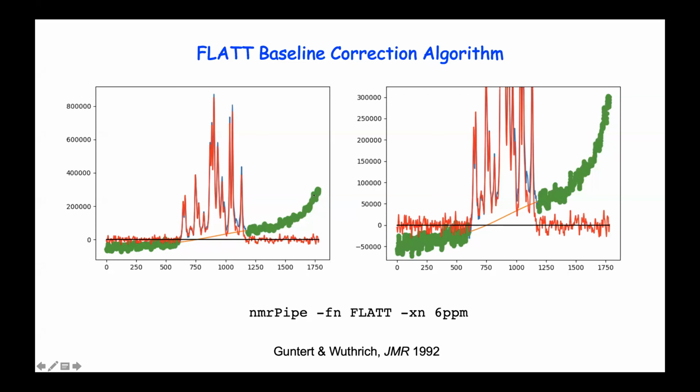This works if you have something like artifacts, and the program may miss it and think that it's a peak and miss the edge, and therefore the reconstruction may not work, particularly on the upfield region. Usually it's very small, from 6 ppm or 5.5 maybe to 6.5, depending on your most upfield peak.